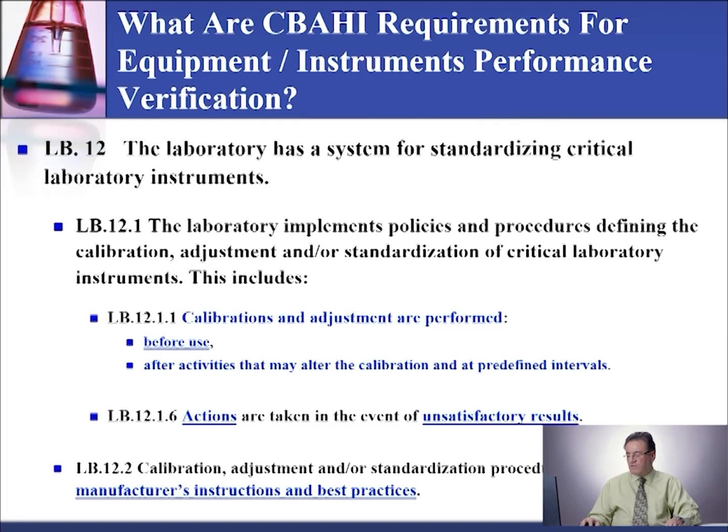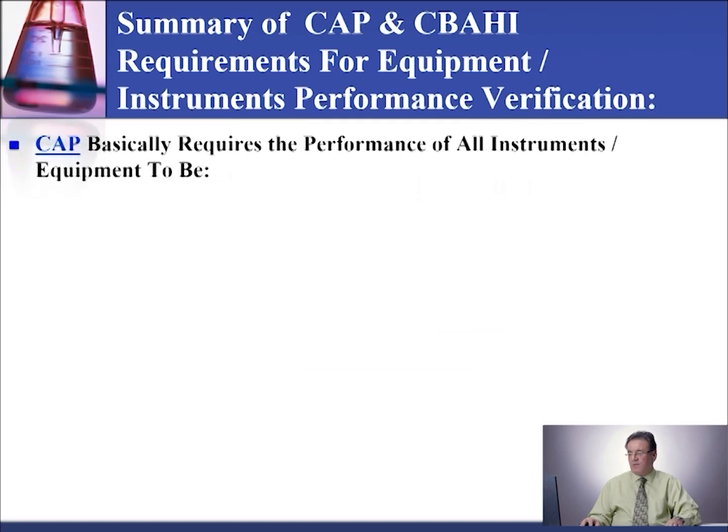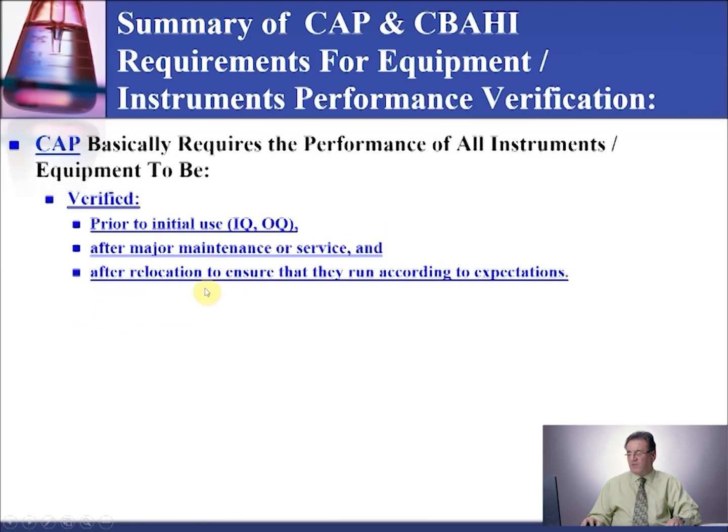These are the tests that you need to do, and this is where you record your qualification verification. For example, software functioning: as applicable, check critical elements and functions of the application software to show that the whole system works as intended. You can say checked, and you can put the date that you did that. Instrument function checks: cleaning, calibration, maintenance. You can say checked, and check, for example, the instrument record or the maintenance folder for the maintenance. And the same thing with secure data storage, backup, and archiving.